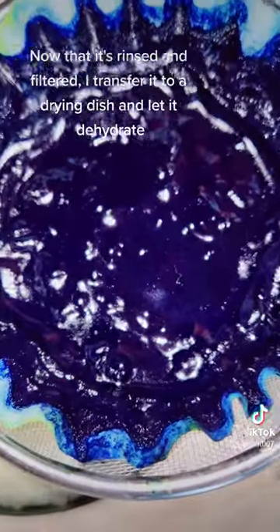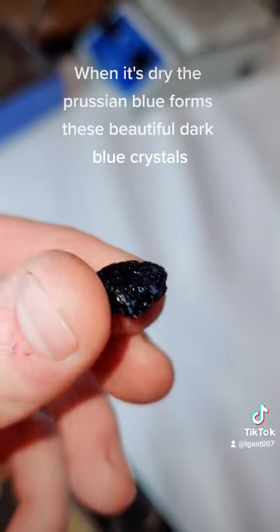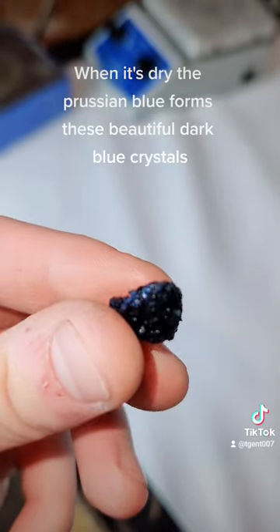Now that it's rinsed and filtered I transfer it to a drying dish and let it dehydrate. When it's dry the Prussian blue forms these beautiful dark blue crystals.